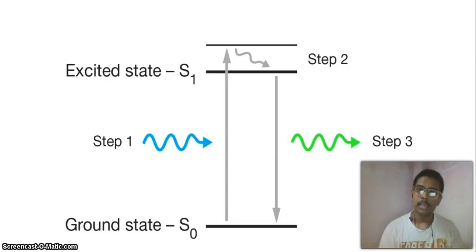For all cases, one statement will be correct: excitation light will be lesser in wavelength than the emission light, or in reverse, emission light will always be greater in wavelength as compared to the excitation wavelength. That has been described by the Jablonski diagram. So you can say from now that emission wavelength is greater than the excitation wavelength.